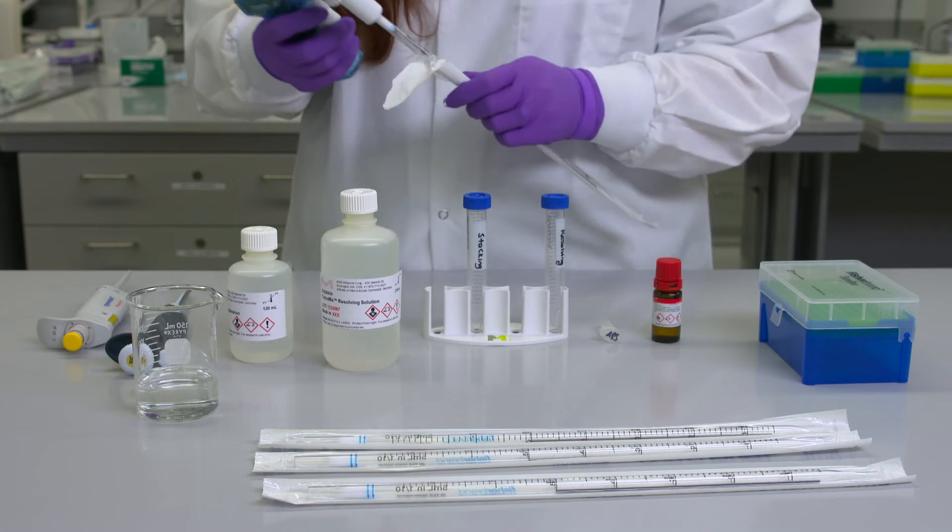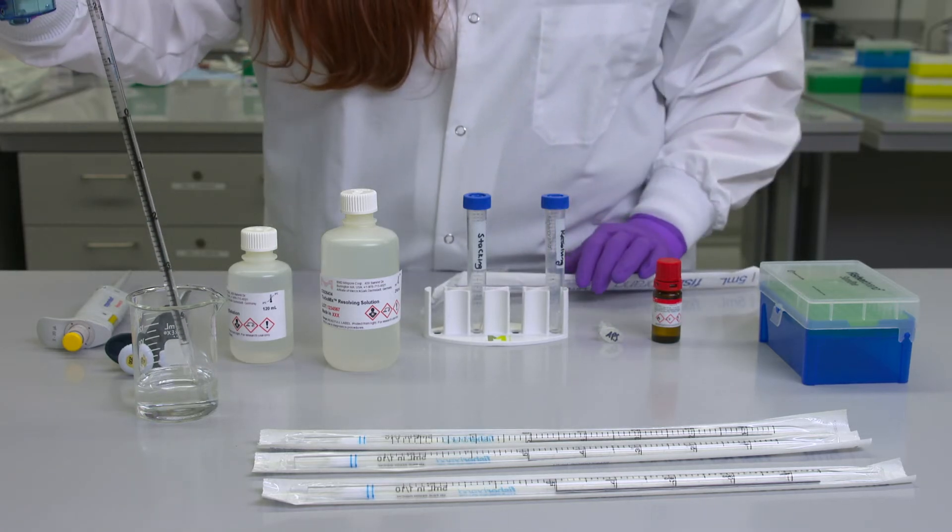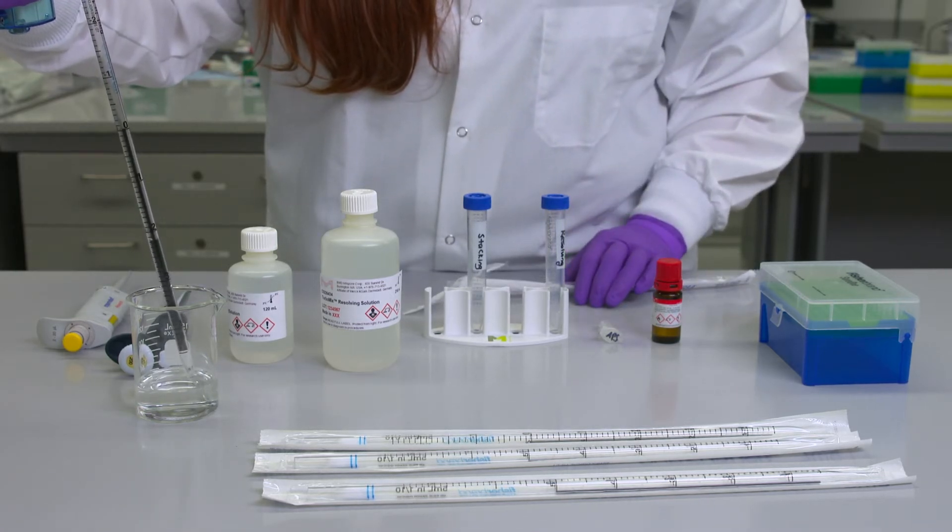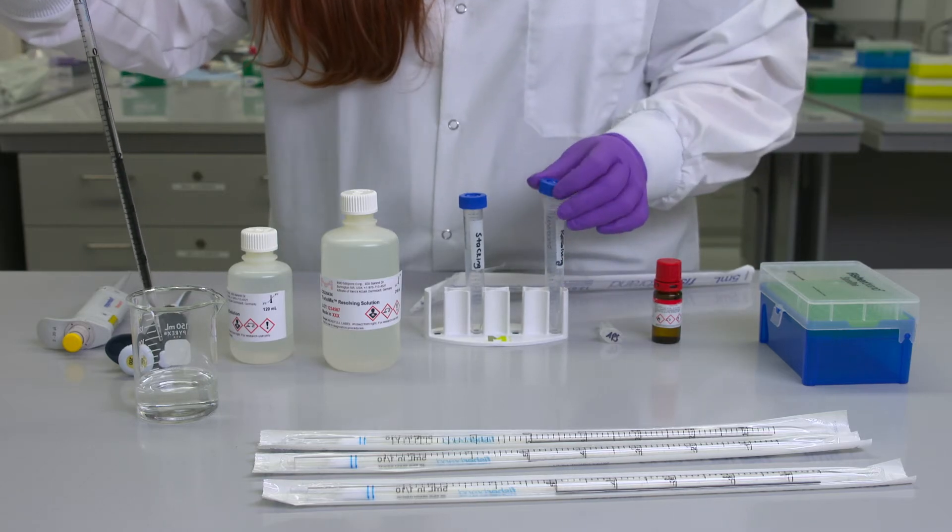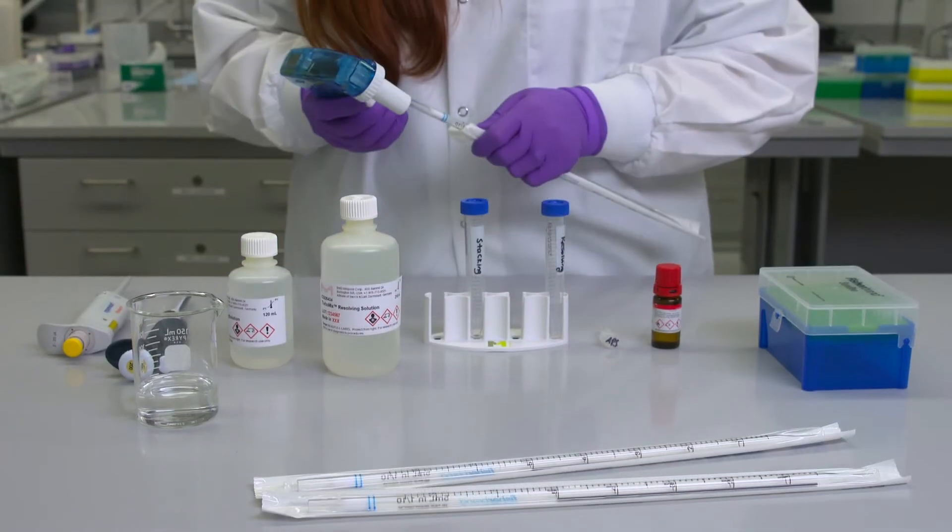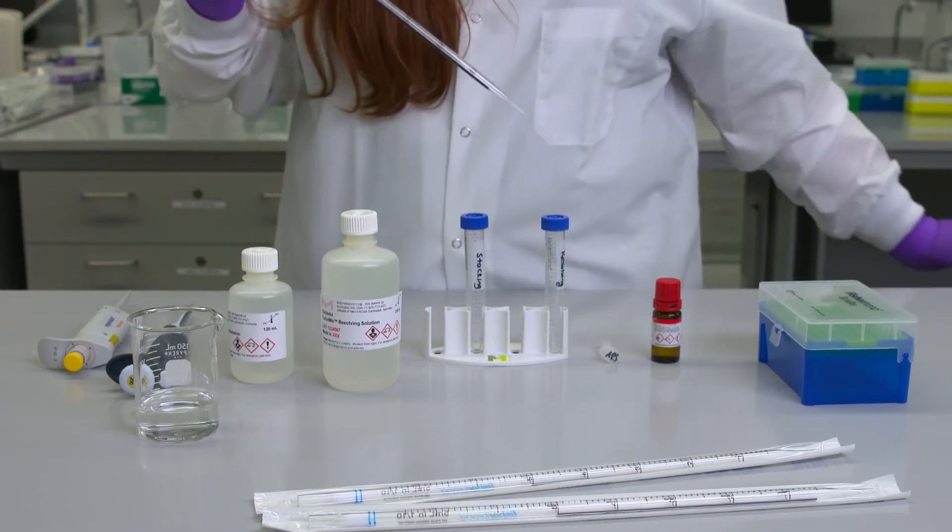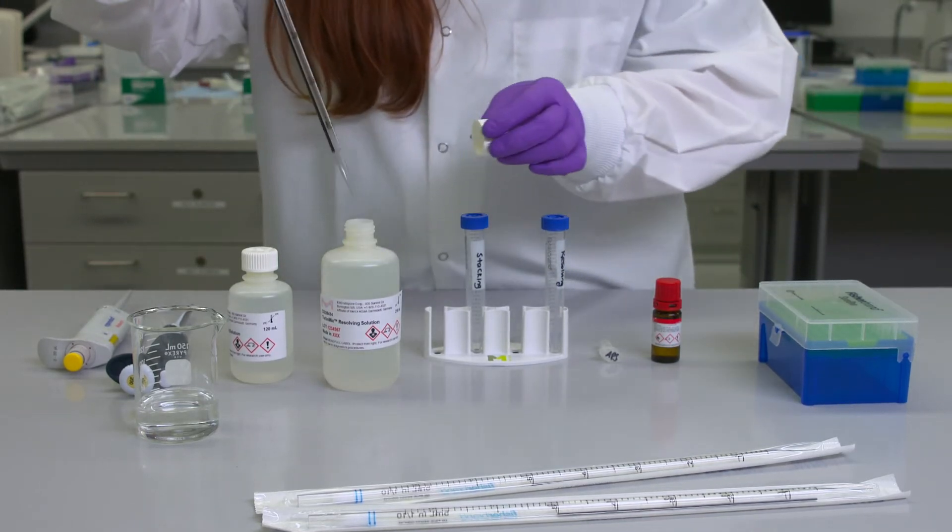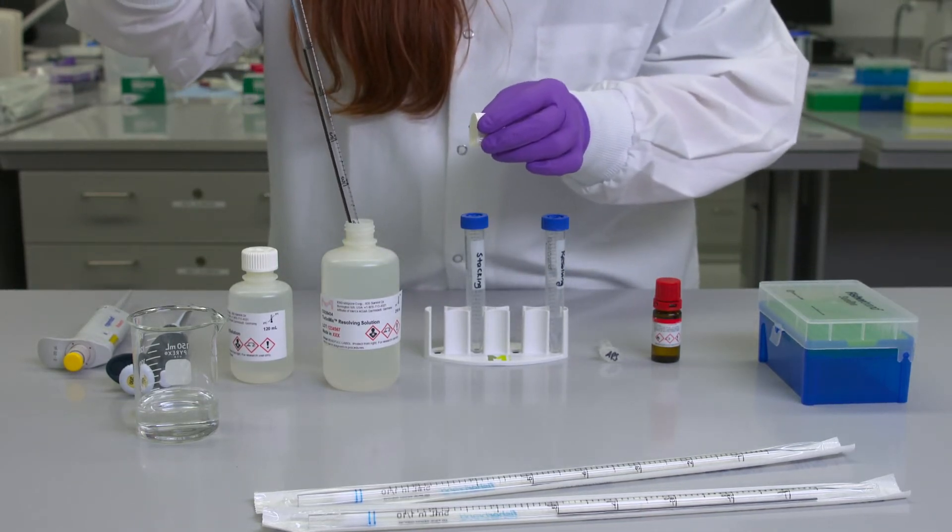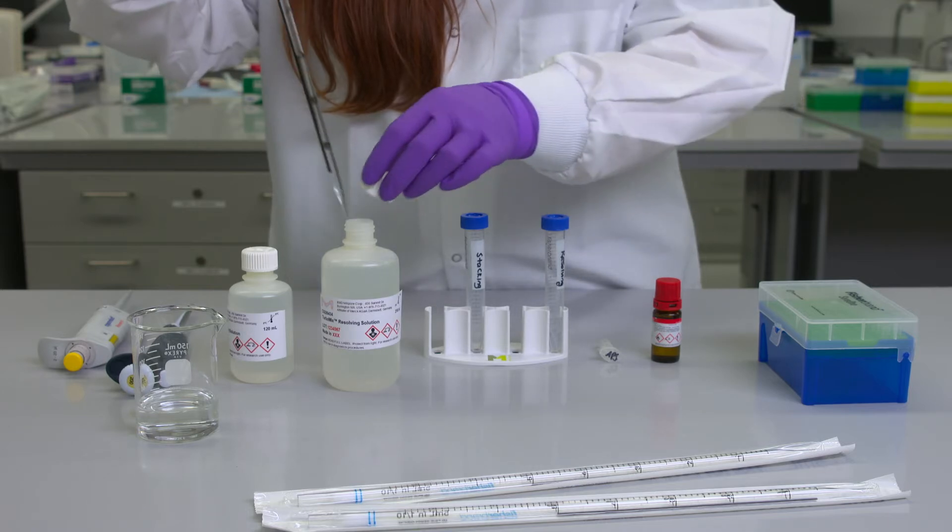The resolving solution is provided at 20% acrylamide and can be diluted with deionized water to your desired gel percentage between 8 and 15%. So to make a 10% gel I'll add 3 milliliters of resolving solution to 3 milliliters of deionized water.